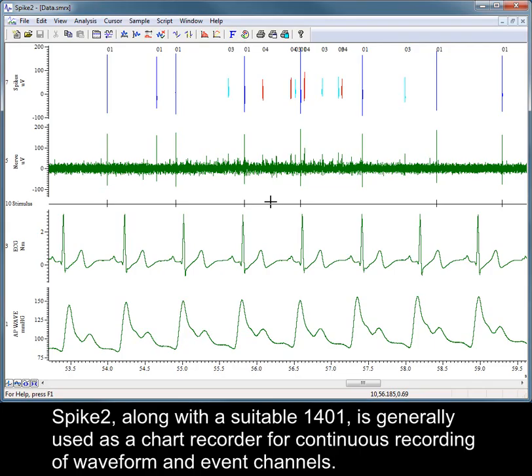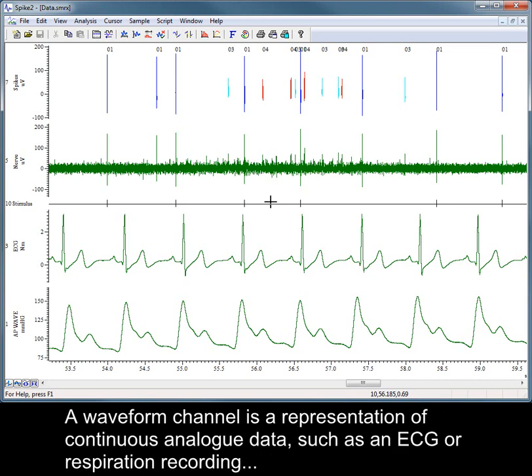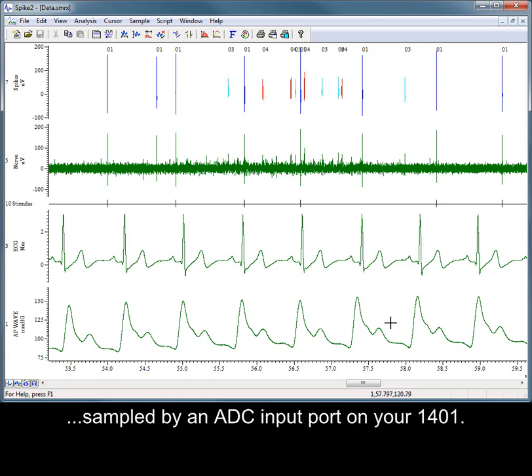Spike 2, along with a suitable 1401, is generally used as a chart recorder for continuous recording of waveform and event channels. A waveform channel is a representation of continuous analog data, such as an ECG or respiration recording, sampled by an ADC input port on your 1401.